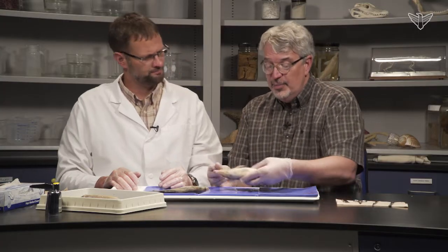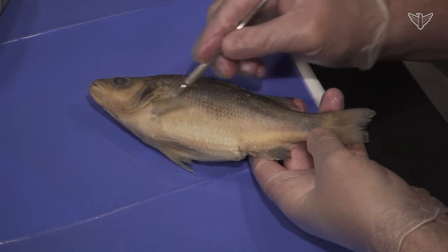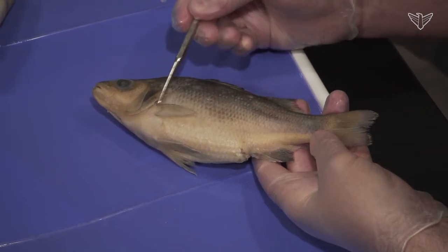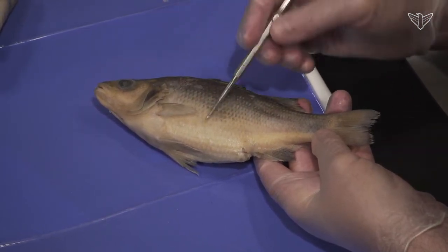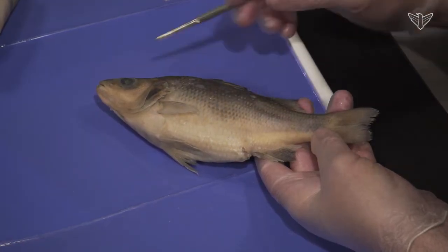Where do you start on this? The main part you want to open up would be the body cavity, which lies roughly behind the operculum to the cloaca. We'll want to cut a flap off the side of the animal. You want to go just underneath the skin, although there is a body wall with some muscle in it and you'll feel it.